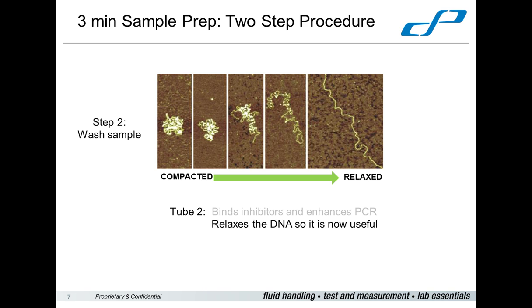So if you were taking your RNA extract, doing an RT step to make it DNA to stabilize it before PCR, then you would do that at this time as well. Once your sample is ready and in this stage here of tube 2, you would treat it as any extracted nucleotide. So if it was DNA, you could store it at -20 or +4, however long you wanted to do that. Or if it was RNA, obviously you'd put it straight into a -80 from here.